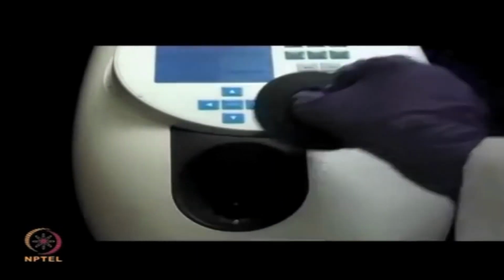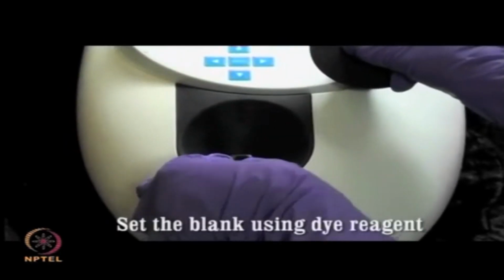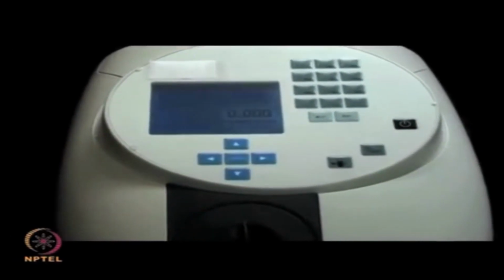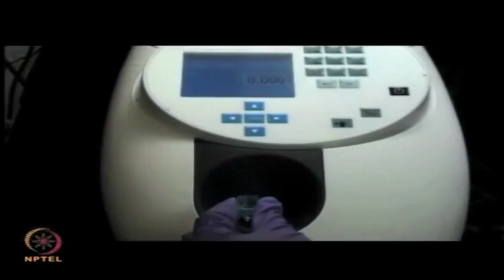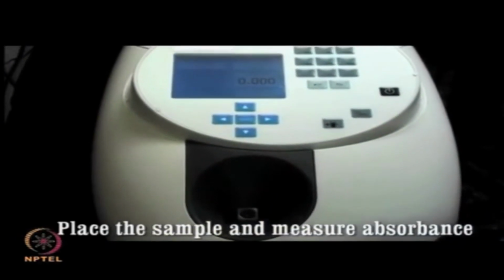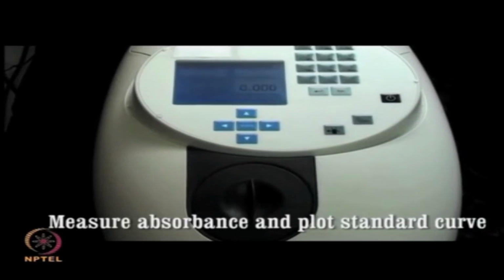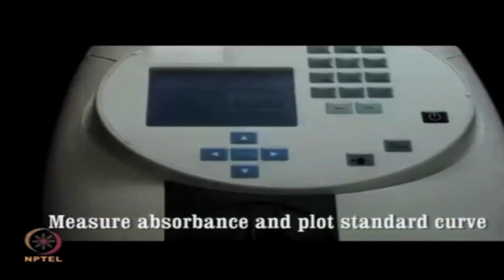Adjust the reading to 0 using a blank solution containing only the dye solution and no protein. Then measure the absorbance of all the standard protein samples of known concentrations, followed by the unknown sample. Protein concentration of the unknown can be determined from the standard curve based on the absorbance value obtained.